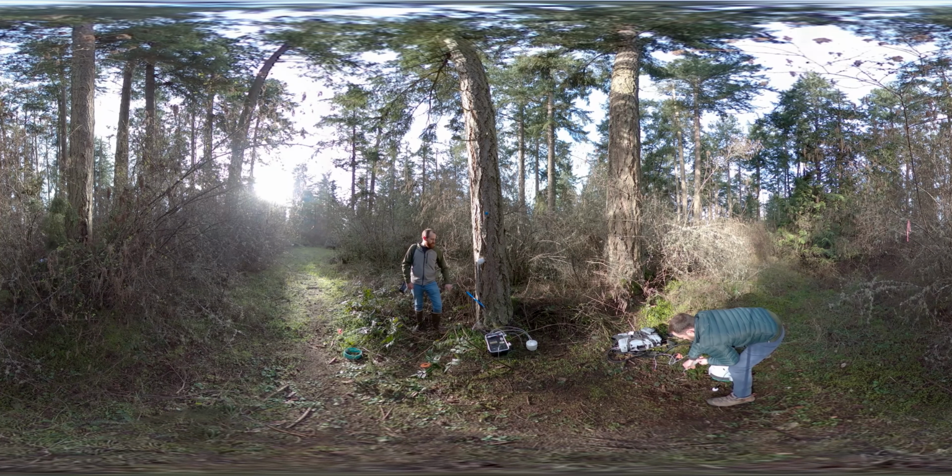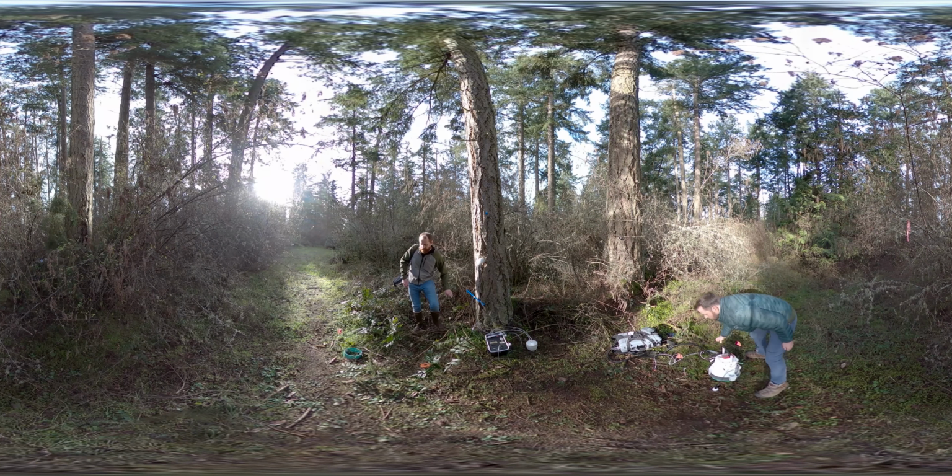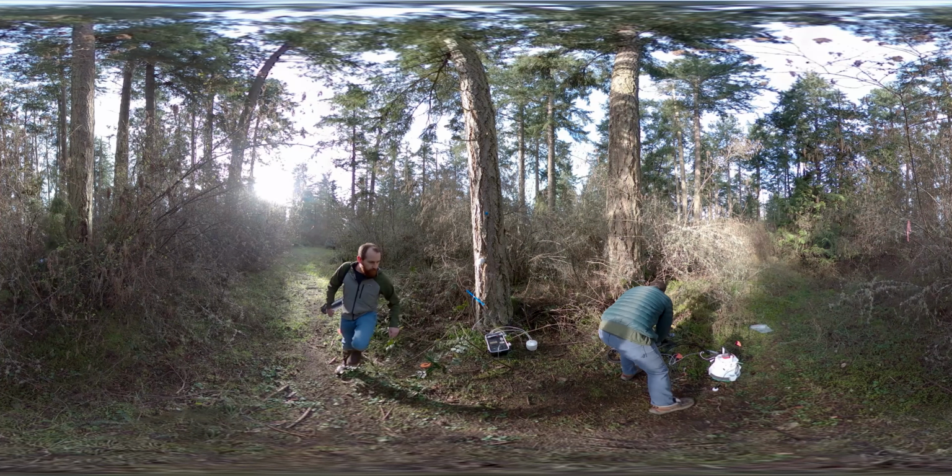The other tools we use are to look at what some of the sources of methane are. Is there evidence of microbes in the wood creating that methane? Our tree cores: we use this borer to drill into the tree and then collect a wood sample from inside that tree. So Matt's going to show you that tree core that we just extracted a few minutes ago.